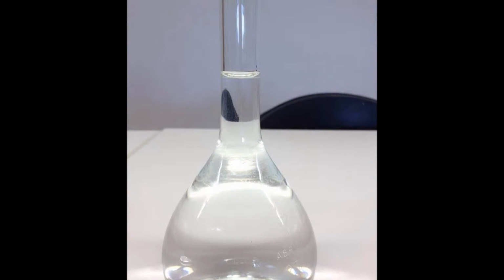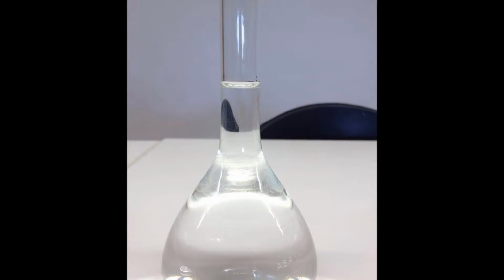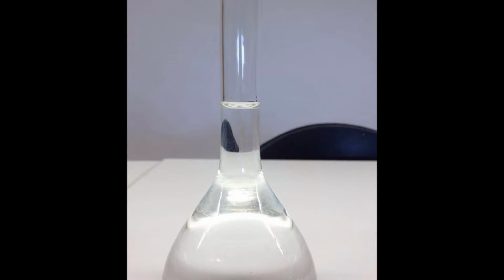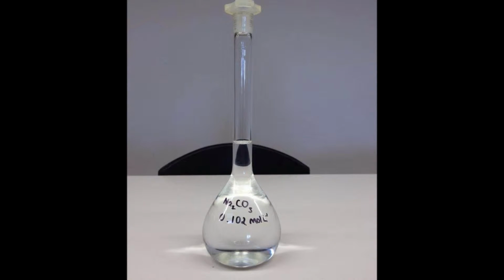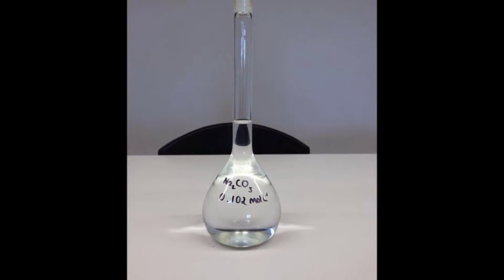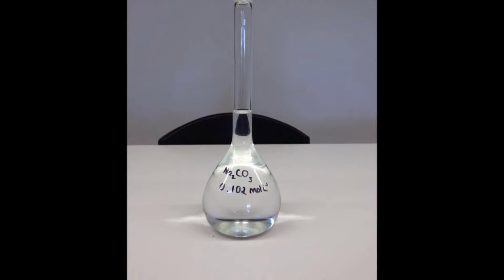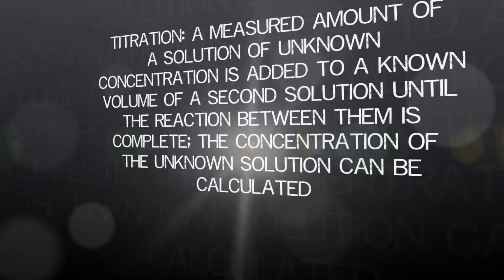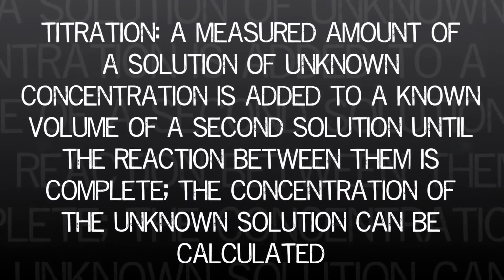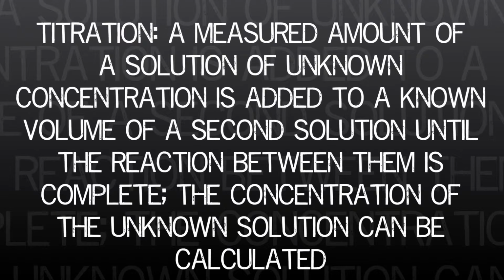6. Fill the flask using the deionized water up to the 250 ml graduation mark. 7. Cover the flask with the glass stopper and invert to ensure the solution is mixed precisely. This has now accurately given a known concentration of the standard solution. With this, the next step of the volumetric analysis may take place: the titration.